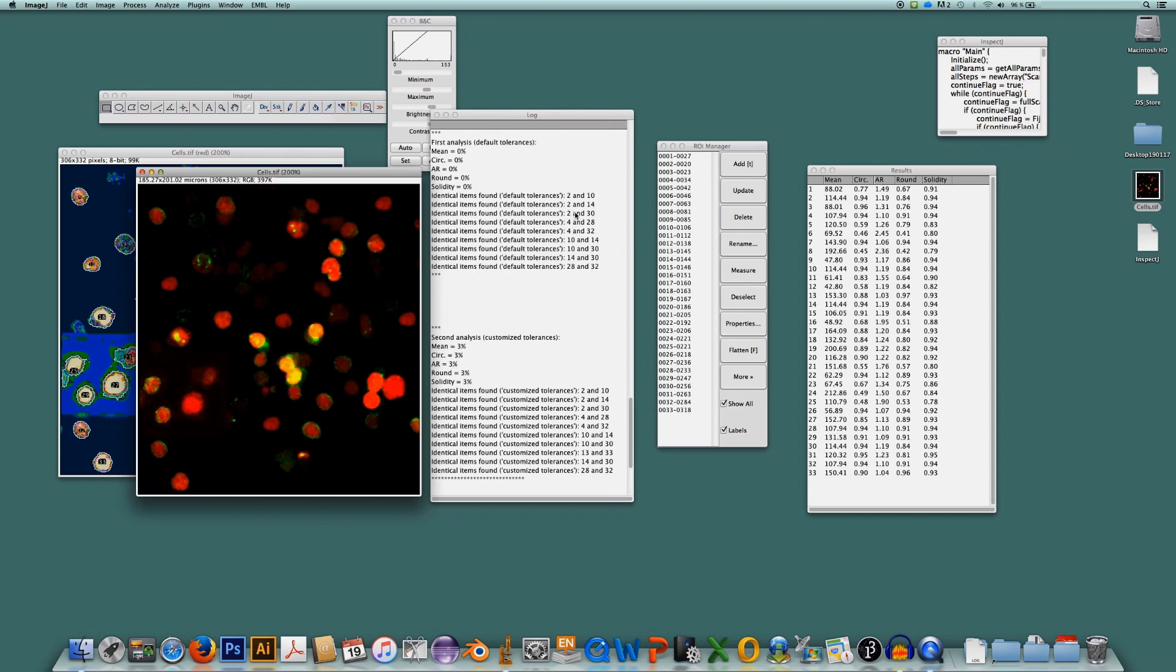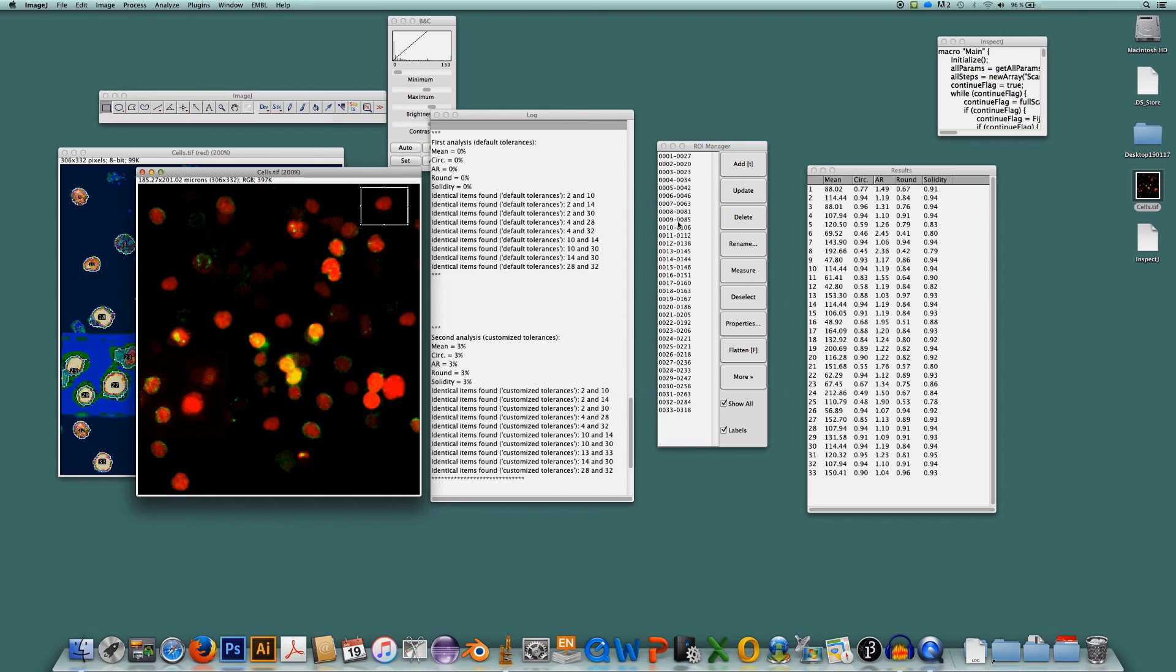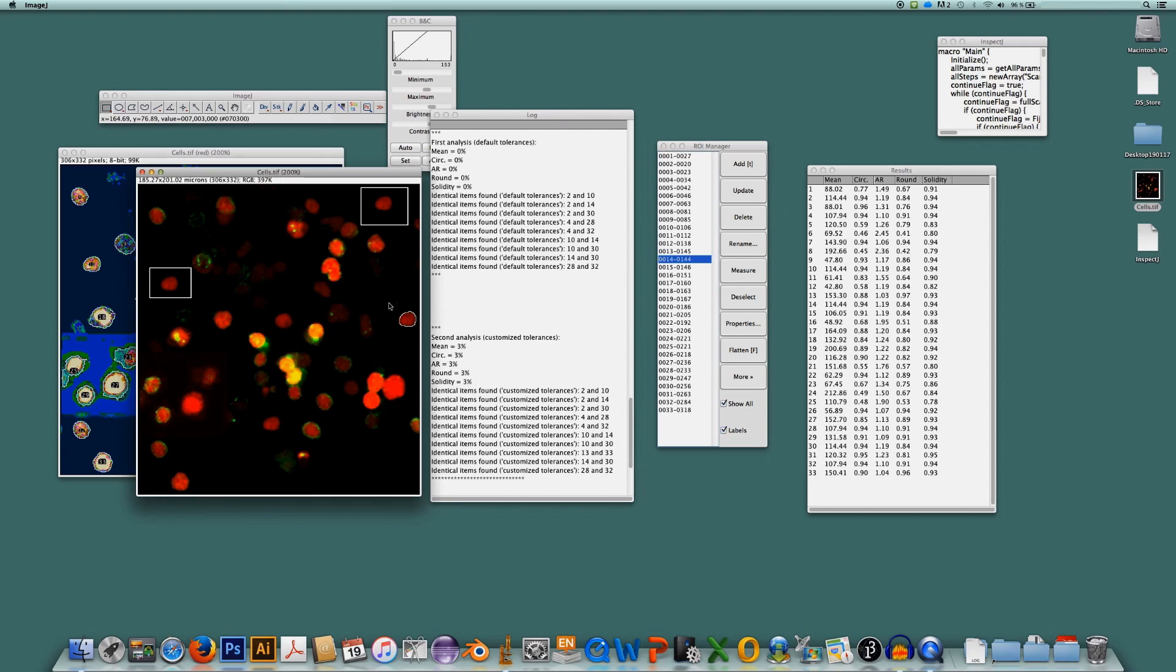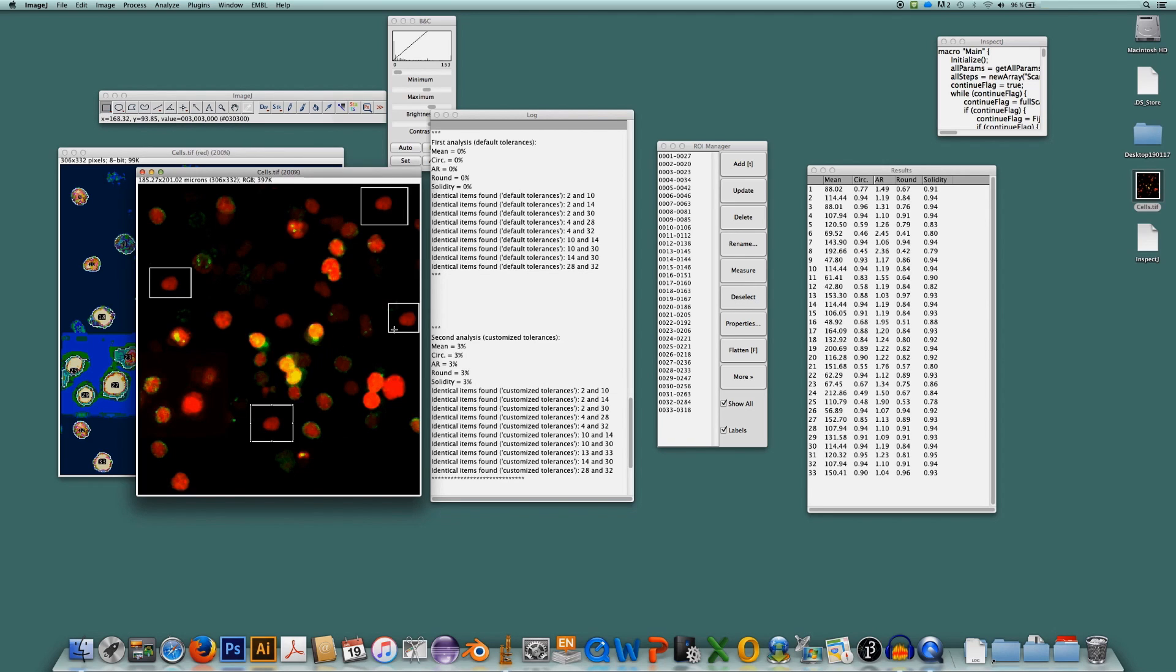So I will first label the objects that are identical for the first group here which is number 2, 10, 14 and 30. So number 2 is this one. I will just outline this. Number 10 is this one. Number 14, which is this one here. Number 30, which is down here. Now after outlining these objects, I think it becomes really obvious that they are identical.